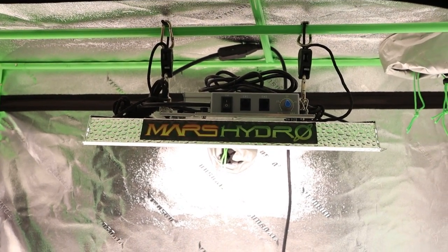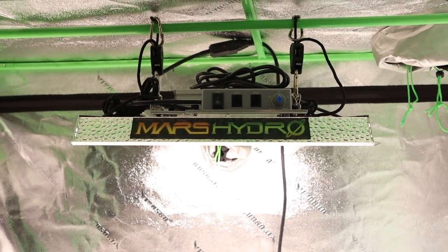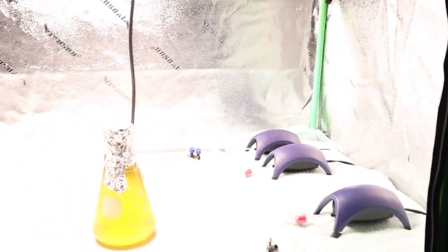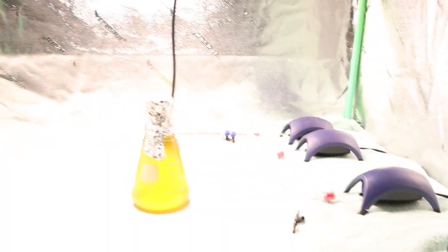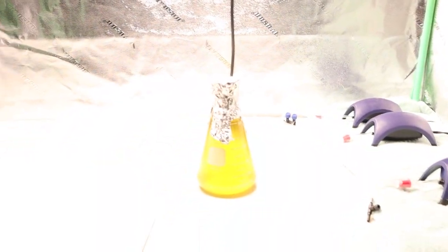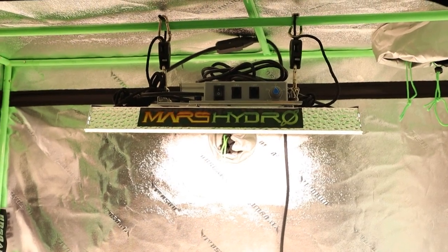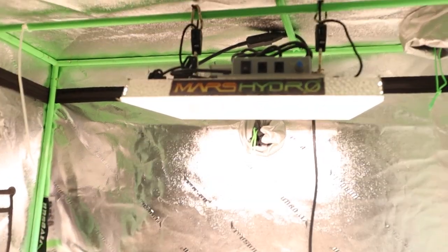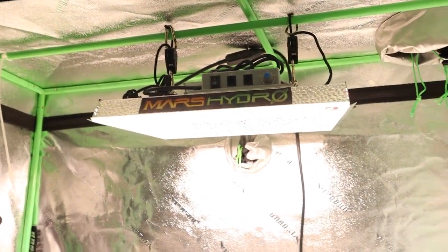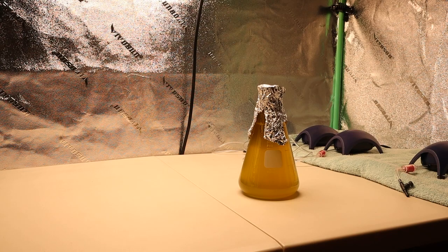For the lighting I use this Mars Hydro TS-1000 set up in a grow tent. Normally I would have my tropical house plants in here, but I've dedicated this grow tent to growing phytoplankton. You could also use T5s if you want to — I just choose to use this LED light panel because it's easier to use and costs less money than running a T5.